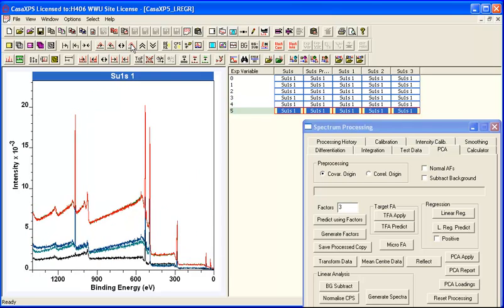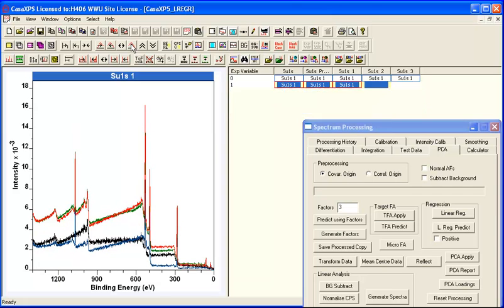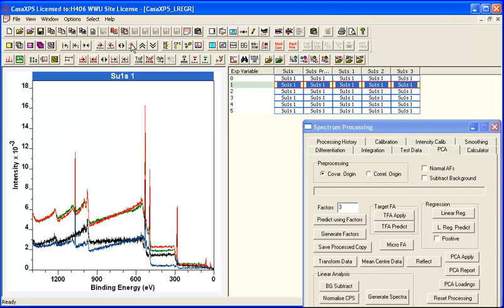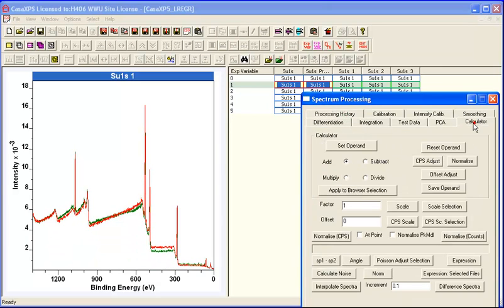in fact, 4 of them. So I've got 3 basis functions, 4 that are well approximated, and then I've got another difference here. So let's try again. Let's overlay these, and again we'll go through and calculate the different spectra.